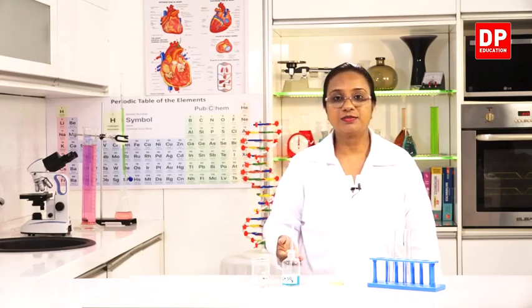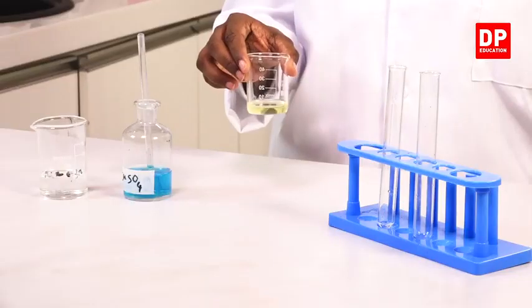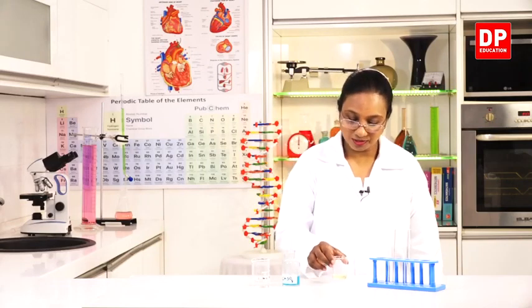Okay students, now we are going to do the activity to test the presence of nitrogen in food samples or the presence of nitrogen as a constituent in biomolecules. We have already done this test with proteins. You know the name of this activity. What is it? Yes, it is biuret test. So I will be needing a sample that has protein so that we can test for the presence of nitrogen, because nitrogen is a constituent of protein.